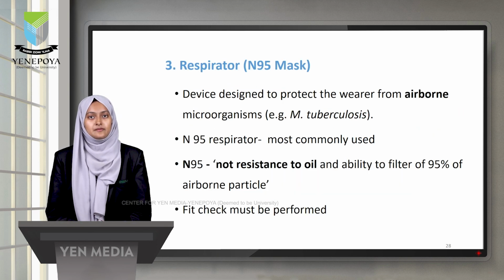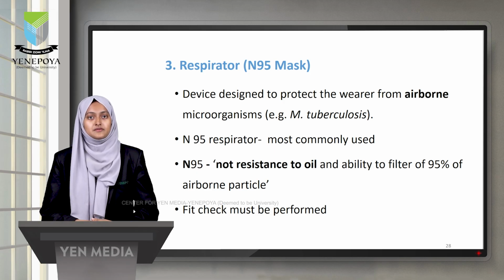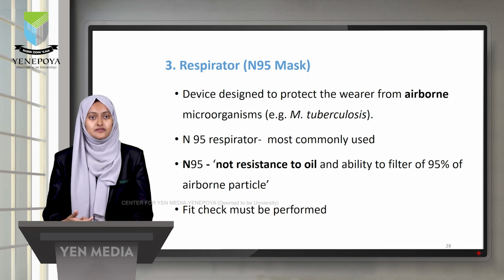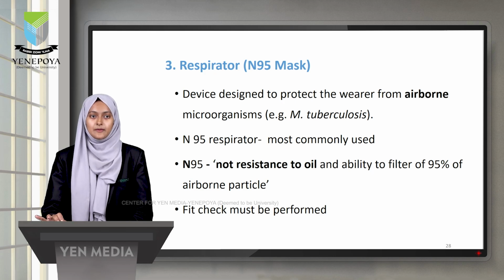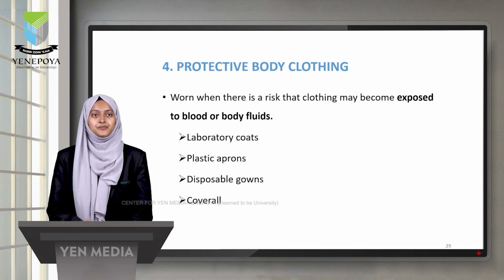Respirator or the N95 mask is designed to protect the wearer from airborne microorganisms like M. tuberculosis. The N in N95 stands for not resistant to oil, and 95 means it has the ability to filter 95% of the airborne particles. Once you've worn the N95 mask, a fit check must be performed to check whether the mask has sealed properly, so that it can allow only clean air to enter and protect you from the contaminants.